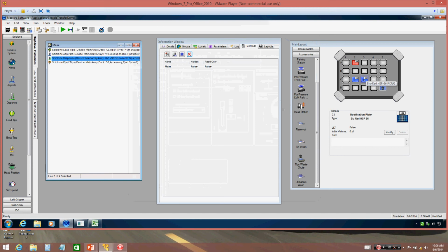So there is a feature though, if you did want to get fancy and create a unique user experience. What you could do is create startup interfaces very similar to what I showed you in our next-gen sequencing automation software. So let's do this.